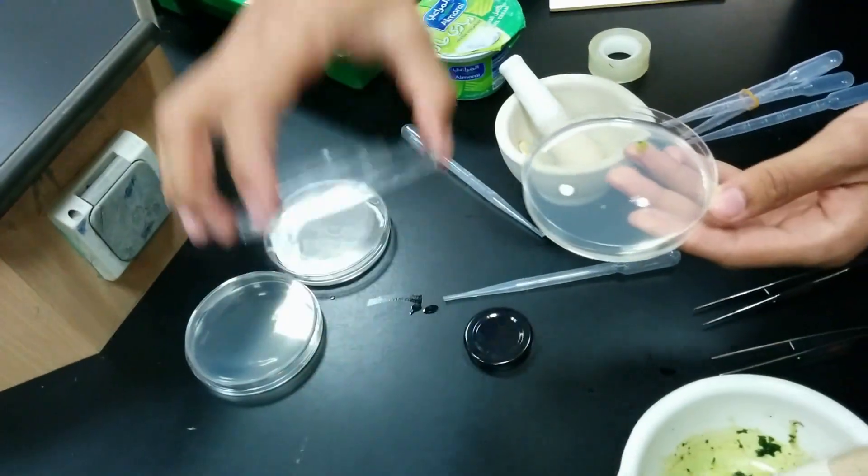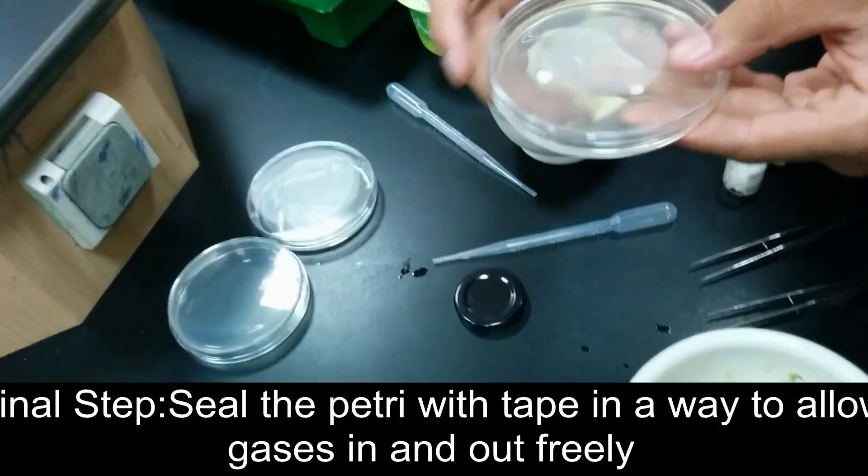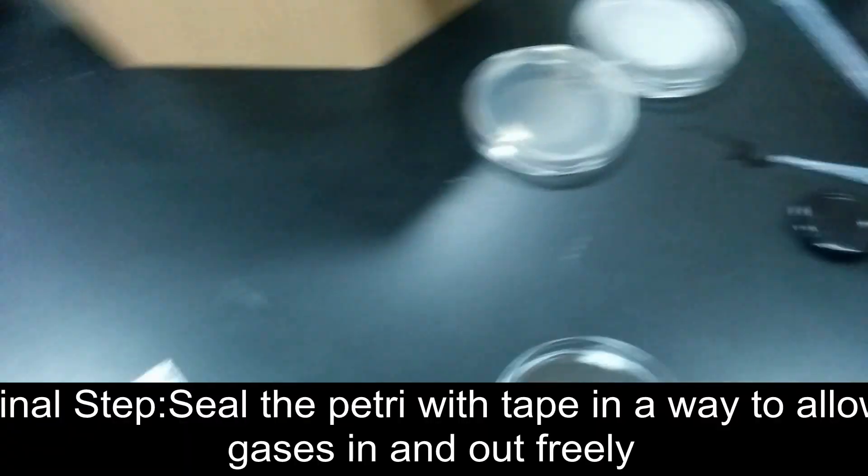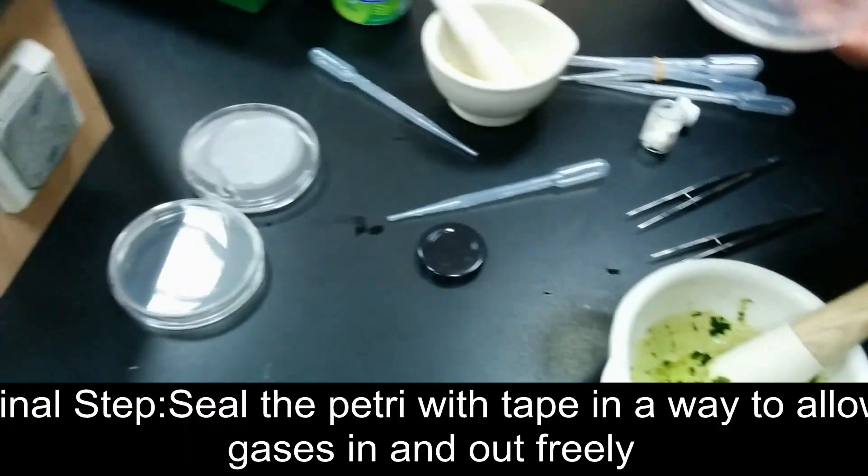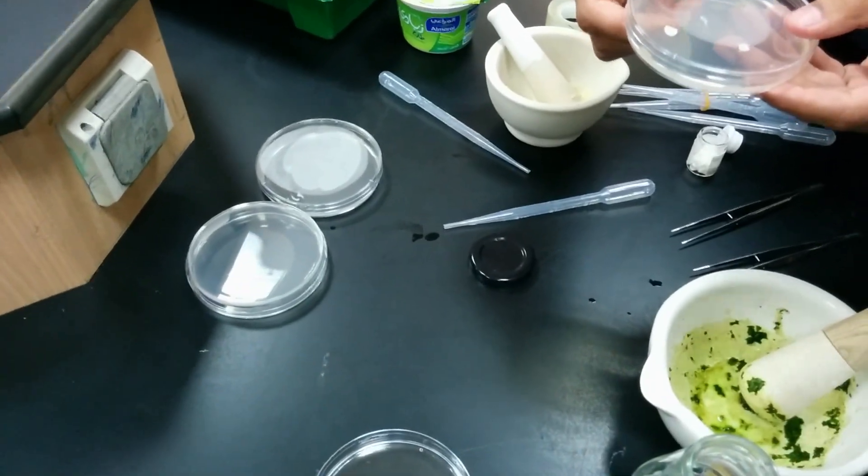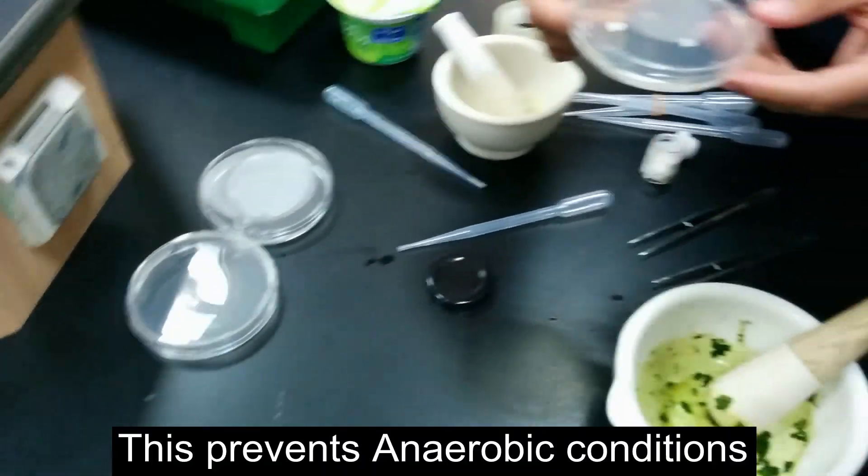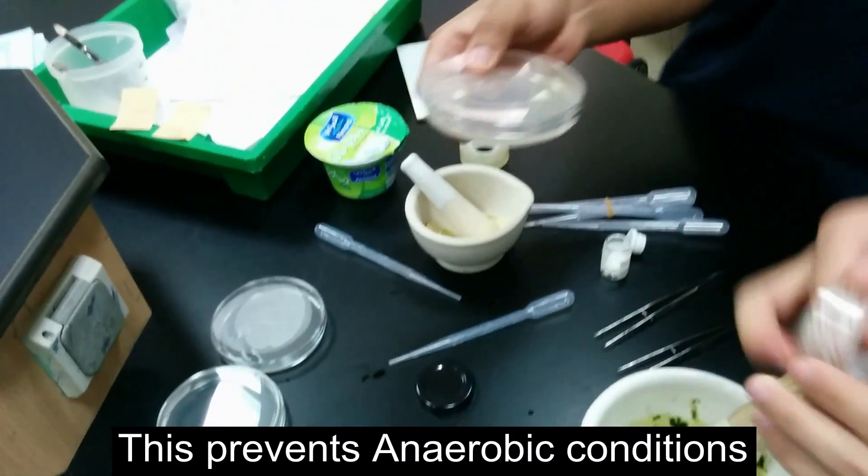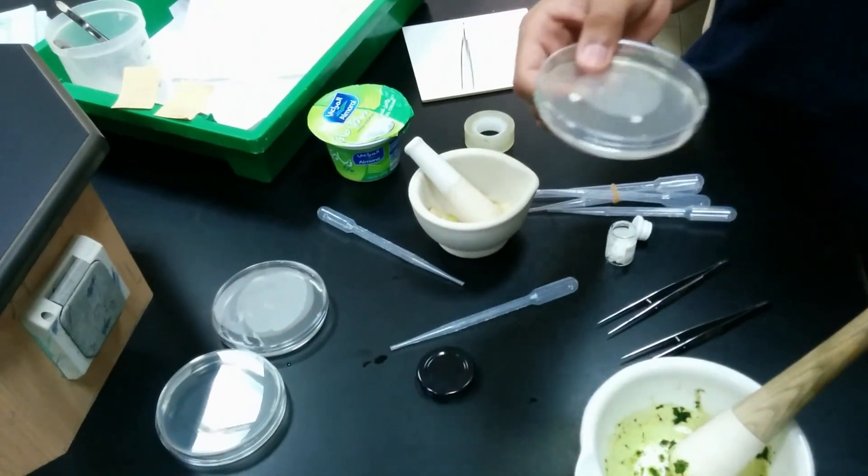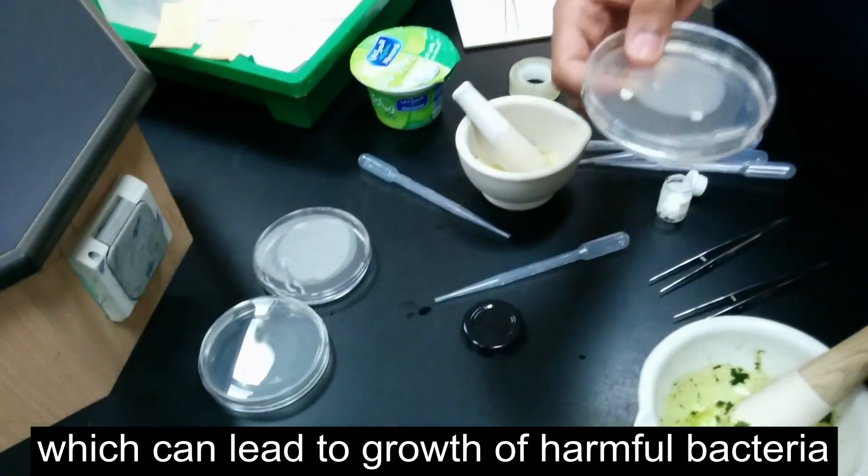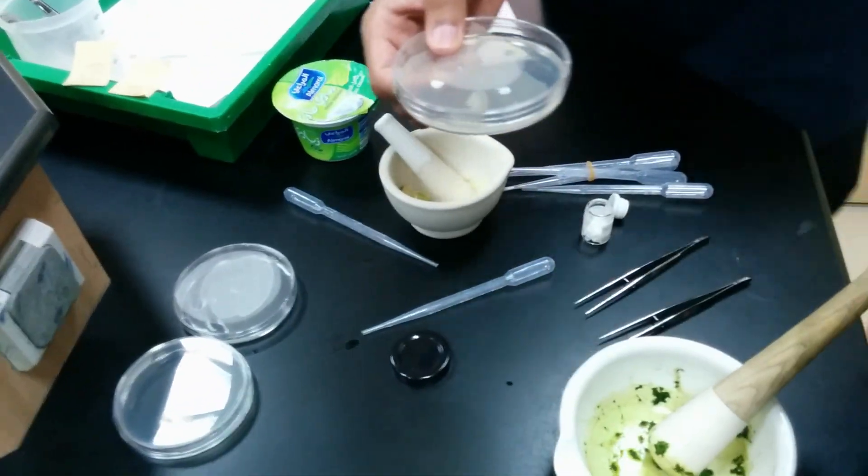Now we have to seal the petri dish with tape. However, it should be sealed in a way to allow gases in and out. By doing this, we would prevent anaerobic conditions, which could lead to growth of harmful bacteria.